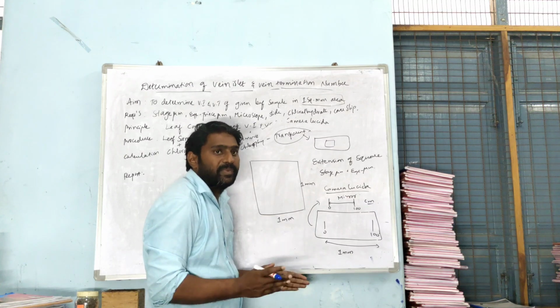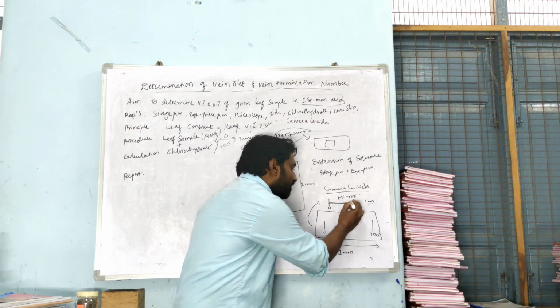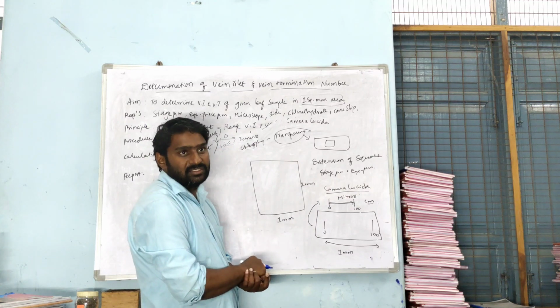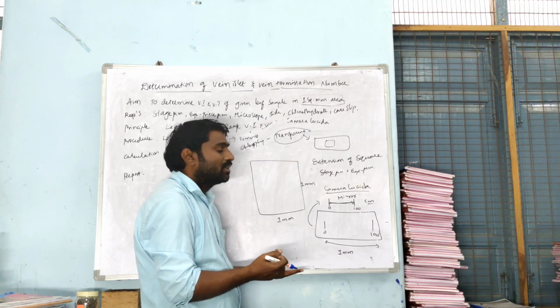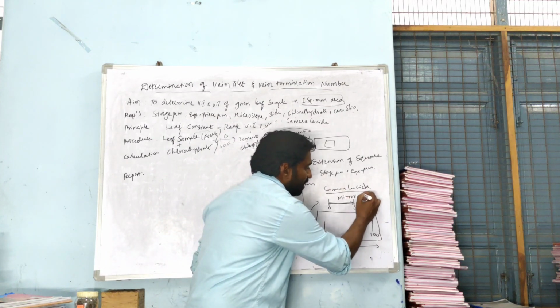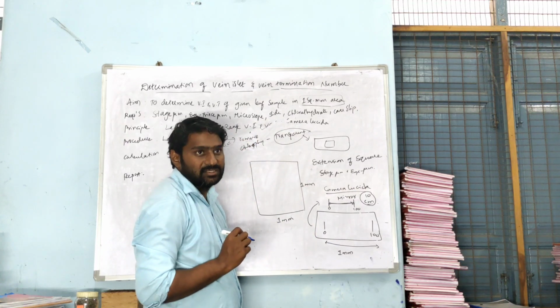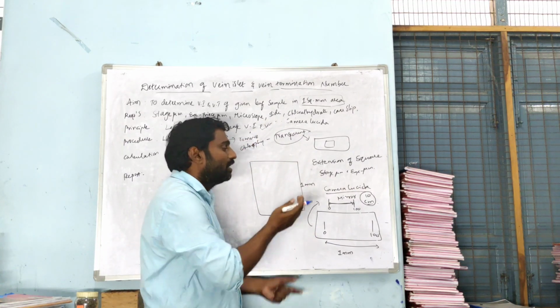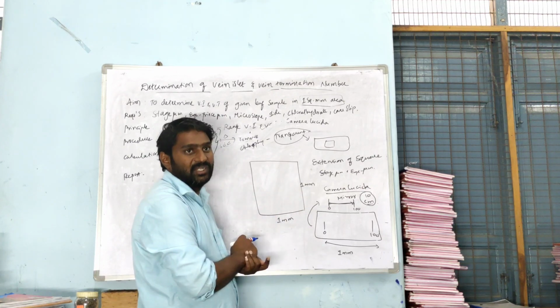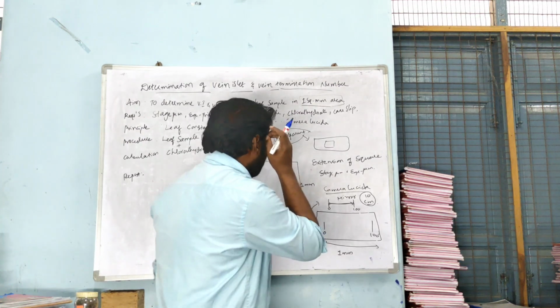So when it is traced onto a paper through the microscope, definitely you could see that the distance between these divisions is more, and which can be measured in centimeters. In practice, generally, as it is a standard scale, you will get it in centimeters. Approximately it may be below 10 or above 10, so I am taking a standard value as 10 centimeters. So now after tracing it by using a camera lucida, what do we understand here?